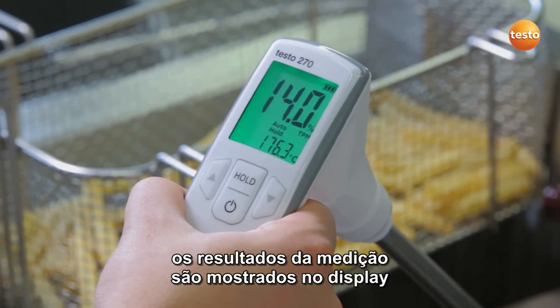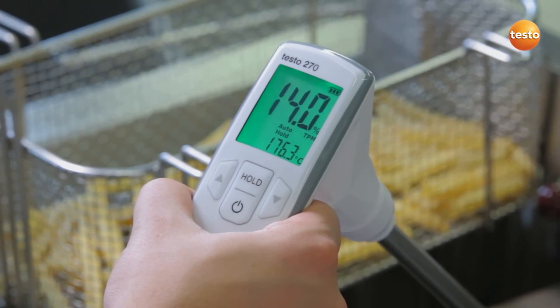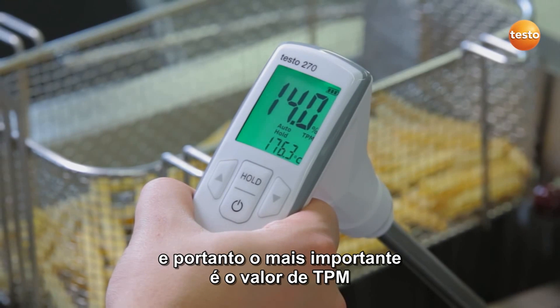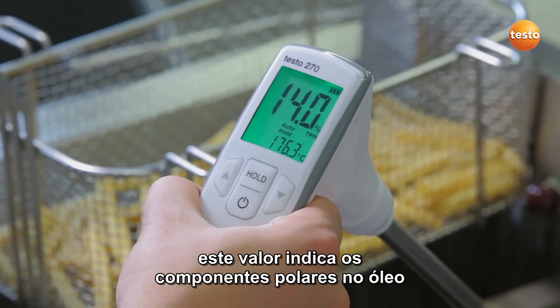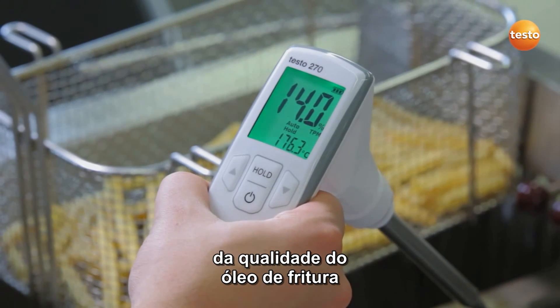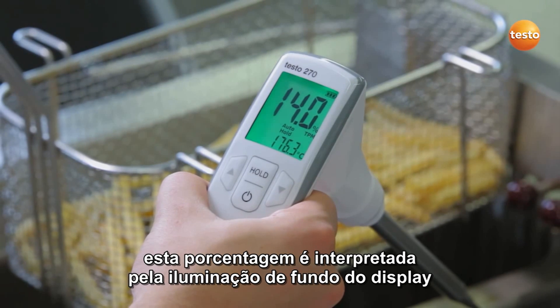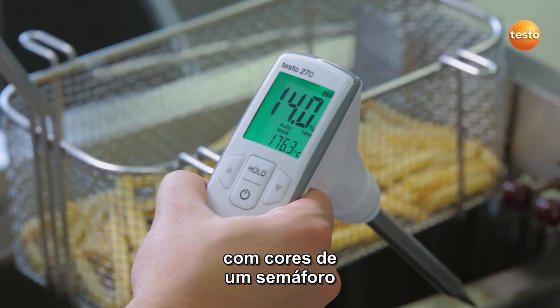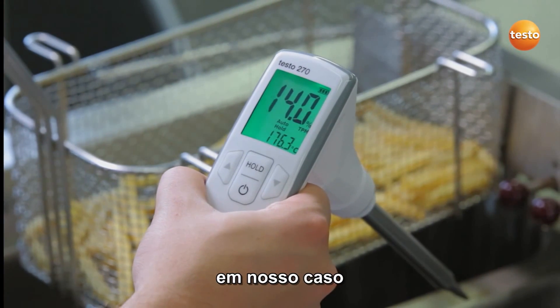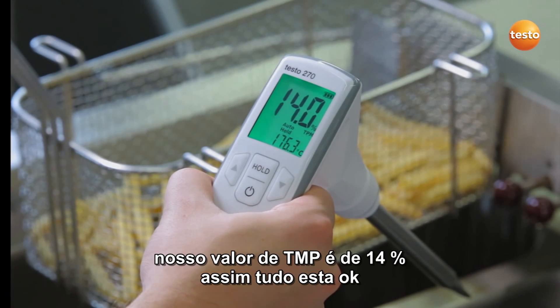The measurement results appear in the display. The smaller value shows the temperature of the cooking oil. The larger value, and the more important one, is the TPM value. This gives the polar components in the oil, which are a sure indicator for the quality of the cooking oil. This percentage is interpreted by the backlighting of the display in traffic light colors. In our case, the display is green — our TPM value is 14%, so everything's okay.